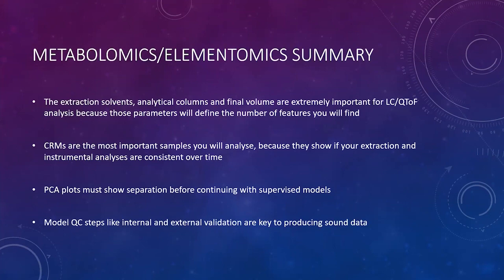So the summary for metabolomics and elementomics is the extraction column, extraction solvent, analytical column, and final volume are extremely important to LC-QTOF because those parameters will define the number of features you find.